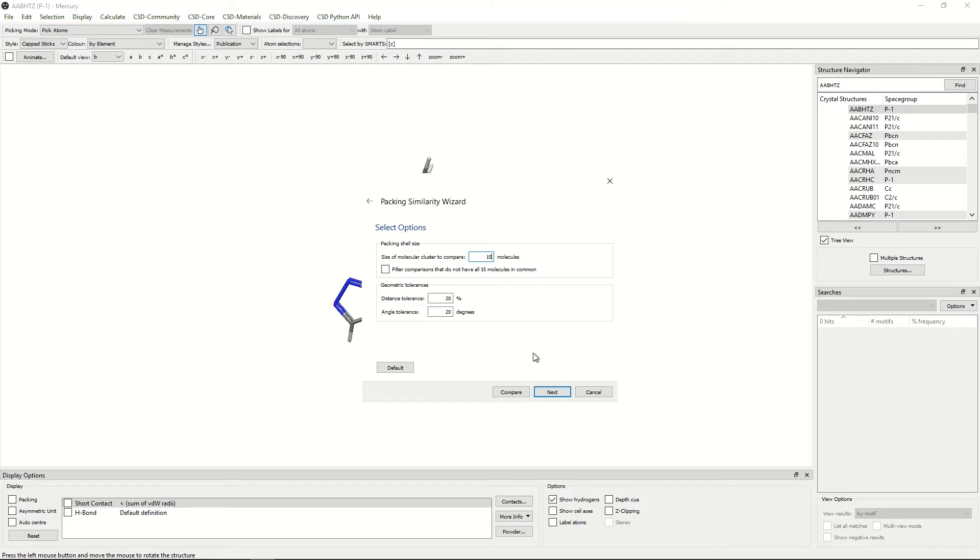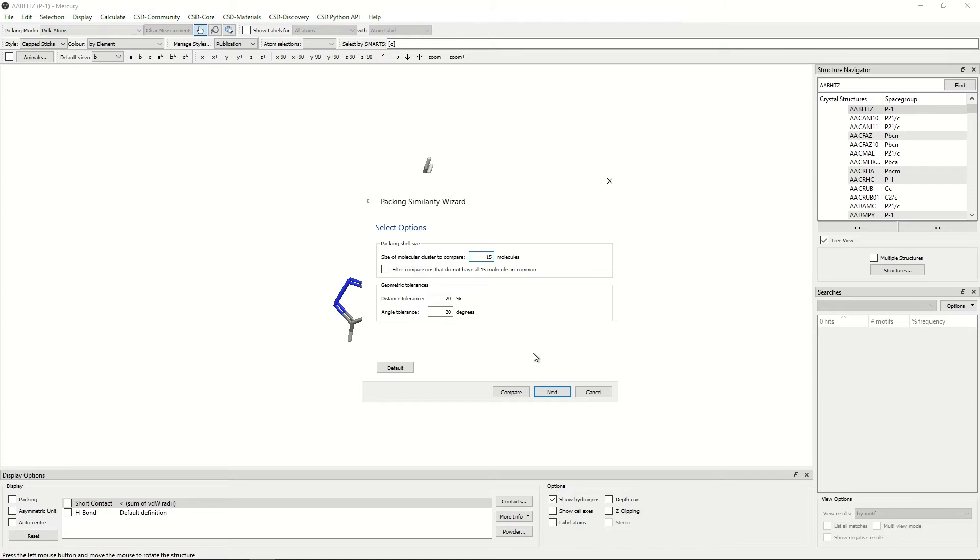The options here allow you to choose the packing shell size and geometric tolerances. The packing shell size allows you to choose how many molecules are in a cluster. The geometric tolerances allow you to choose the angle and distance tolerance you will allow when molecules overlay. If at any point you have changed these and would like to return them to the default settings, you can click default here. Again, we will click next.